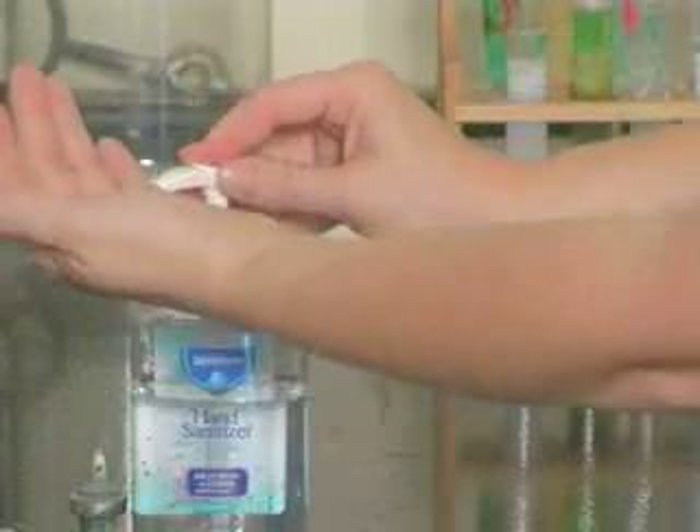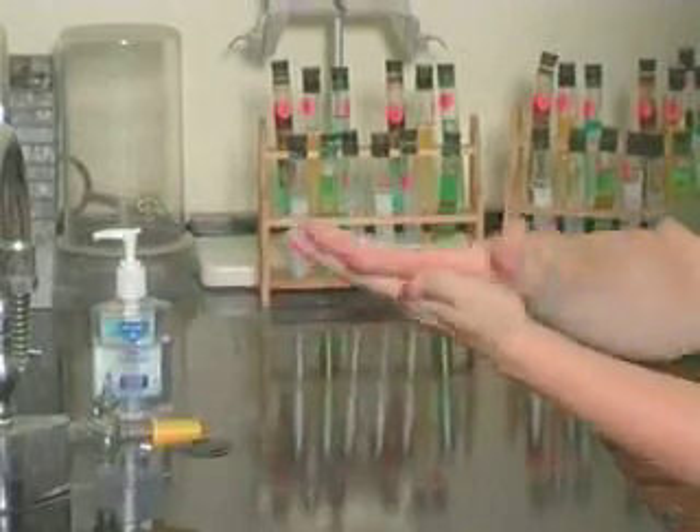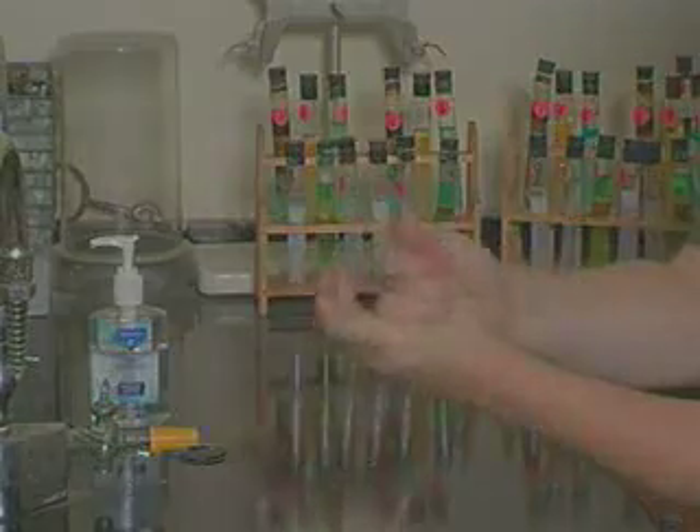Throw away both gloves in an appropriate container. Use an alcohol-based hand rub to clean your hands and other exposed skin.